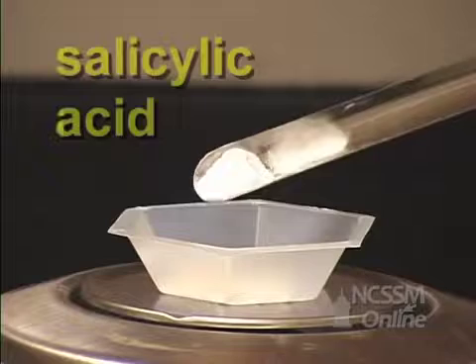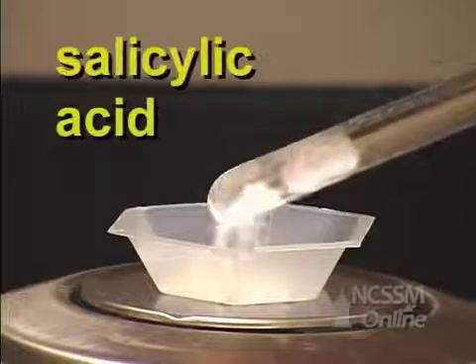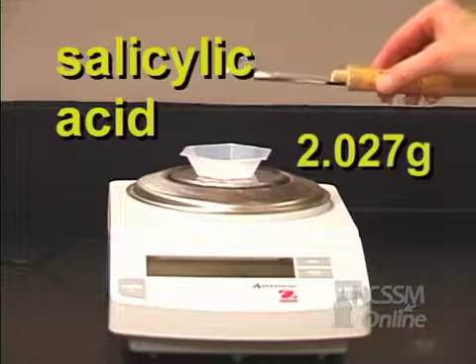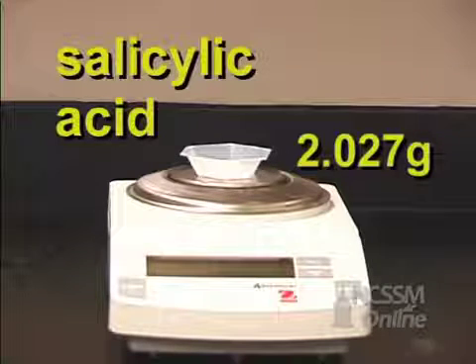We want to weigh out 2 grams. Actually, we have 2.027 grams. So record that number.